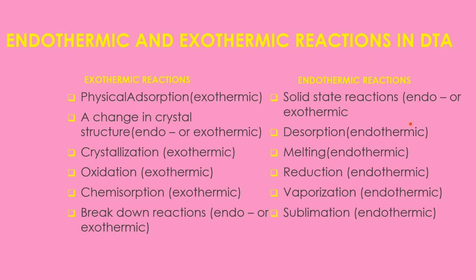Now what are the endothermic reactions? We can see all solid state reactions, like breakdown reactions, can be endothermic or exothermic. Desorption is exclusively endothermic. While physisorption and chemisorption are exothermic, desorption is endothermic. That is, we have to supply something for the desorption to take place.